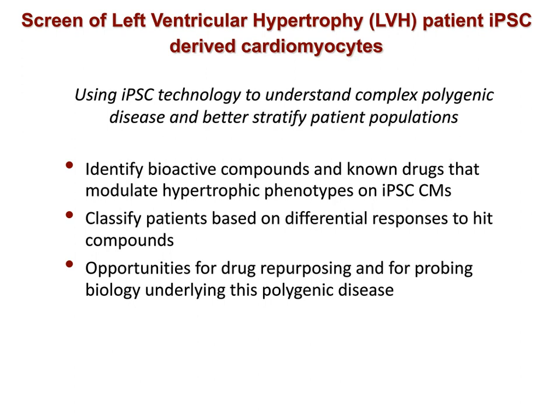Our initial screen is focused on known drugs and bioactives, so there could be possibilities or opportunities for drug repurposing. But importantly, we may identify compounds that would aid in probing the biology underlying this polygenic disease and leading to better target identification.